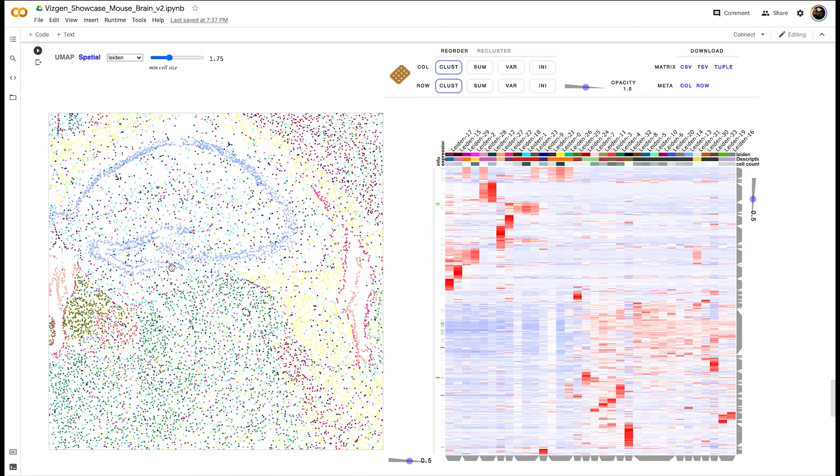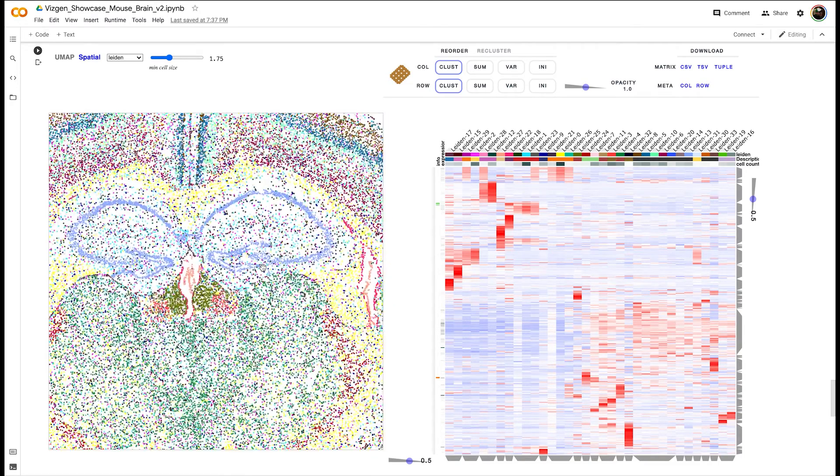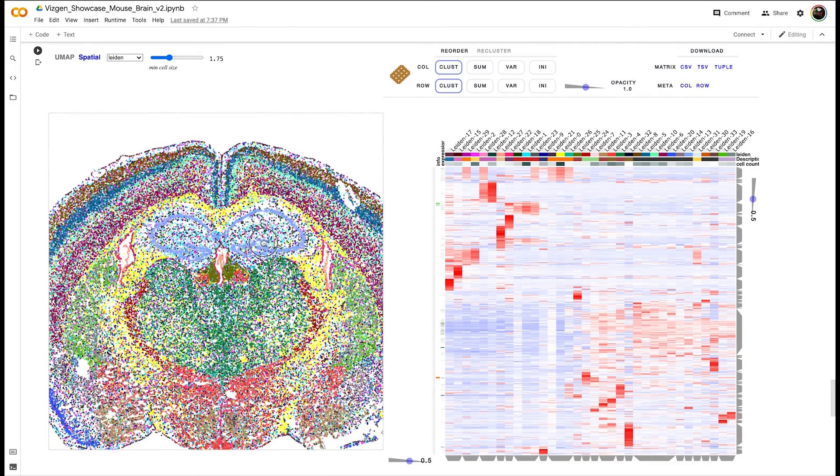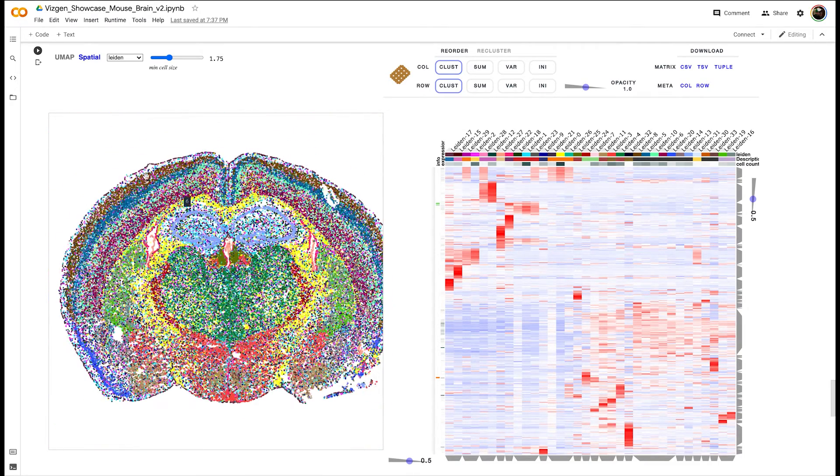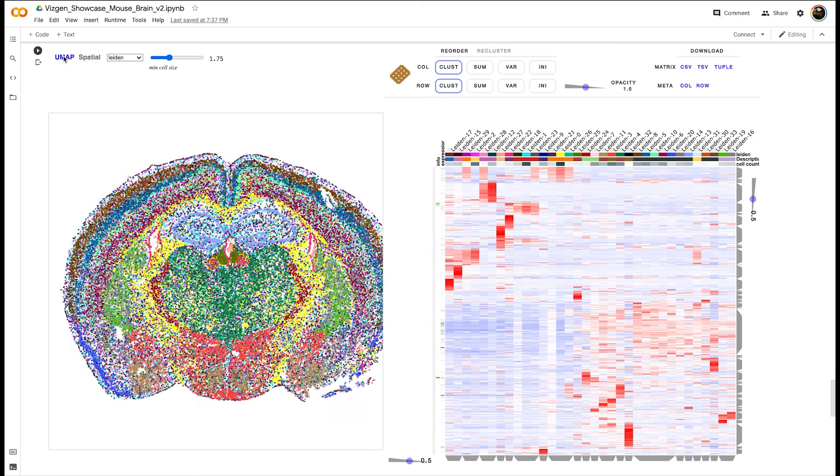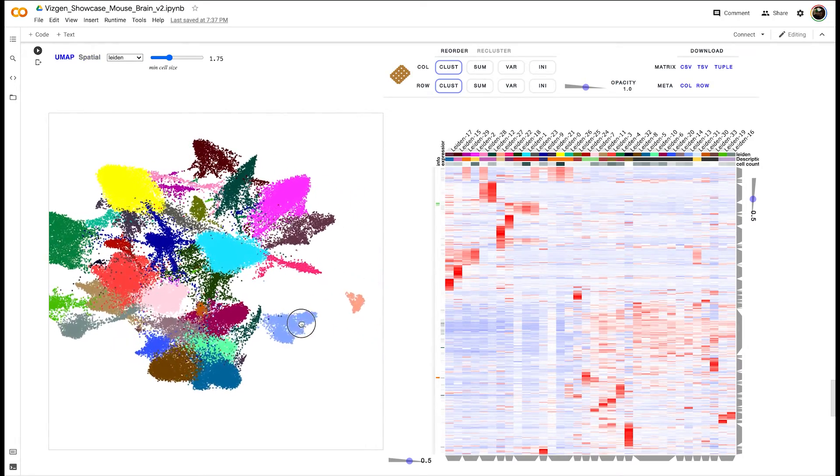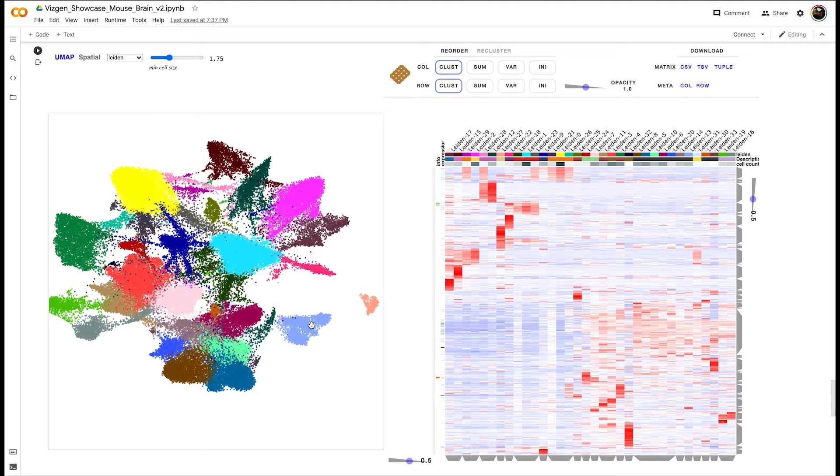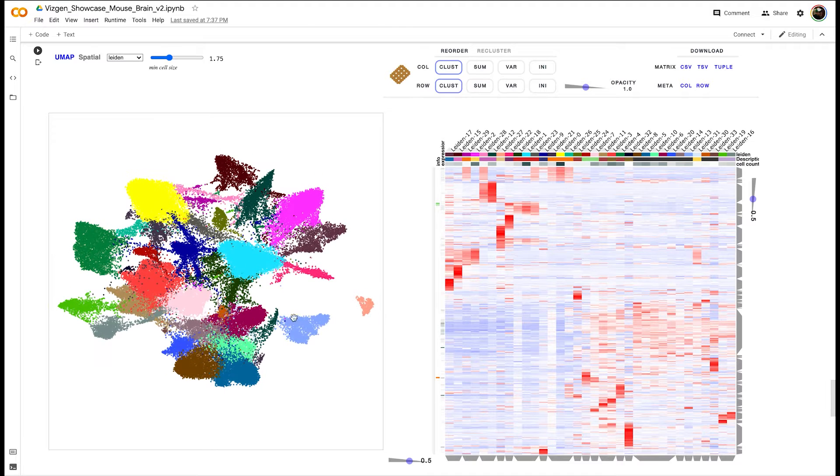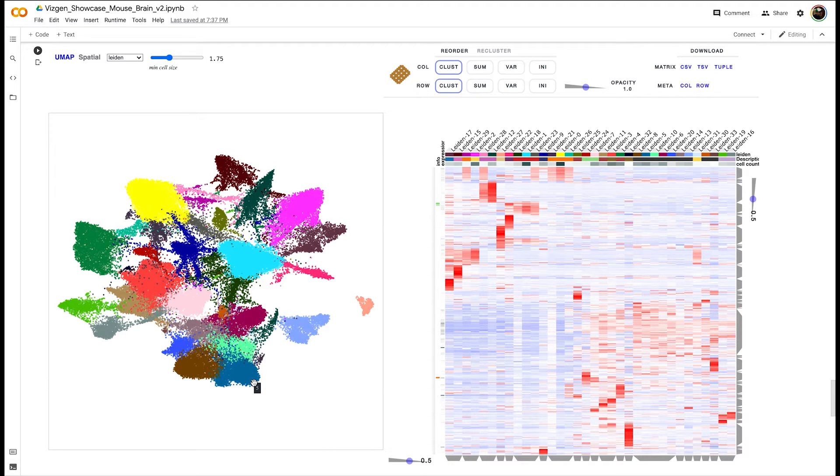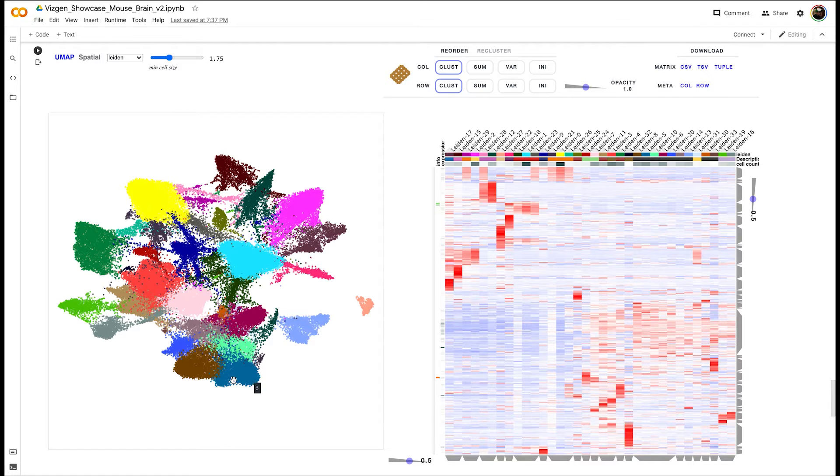You can also click the UMAP button to visualize the cell's positions within the dimensionality-reduced UMAP space. This is a popular technique to visualize high-dimensional gene expression data for single-cell data or otherwise.